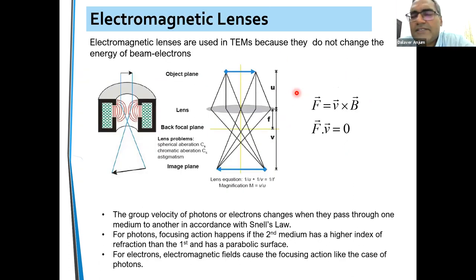This is the physics of the electromagnetic lens. As I said, we have a bunch of coils in the form of circles and we apply electric current. And in the center, we then have magnetic field lines. These are the field lines that will bend the electrons at a certain energy. So we basically optimize all that. And then when the electron passes through them, we use this Lorentz equation. It's purely the B field. It doesn't have any contribution from the electrostatic term.